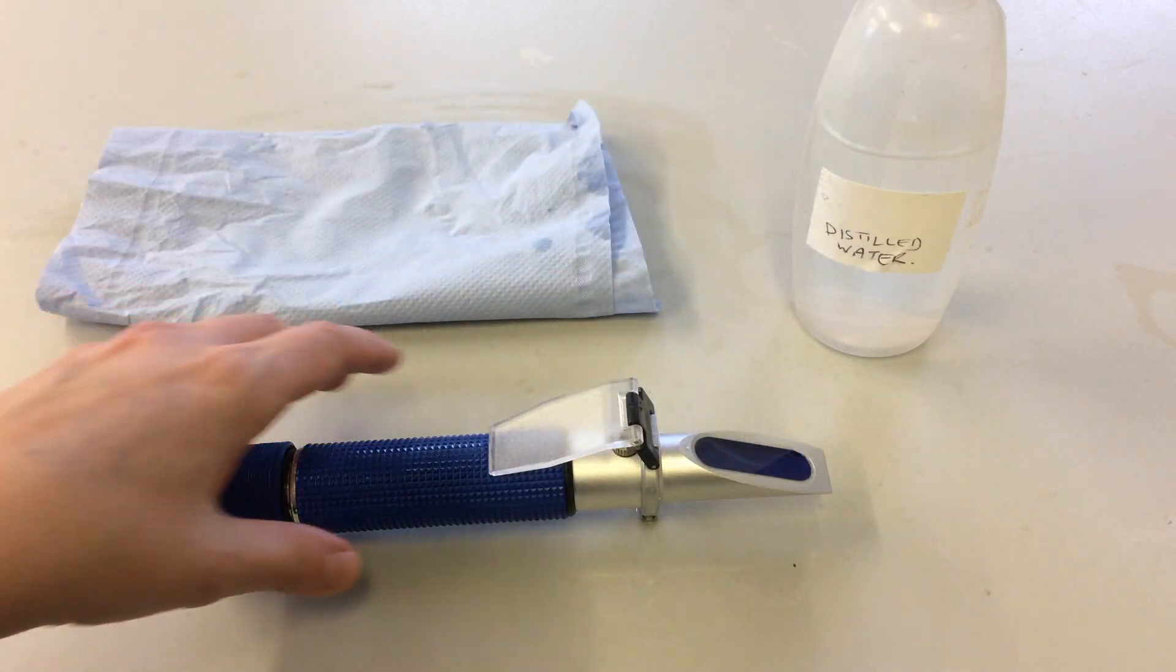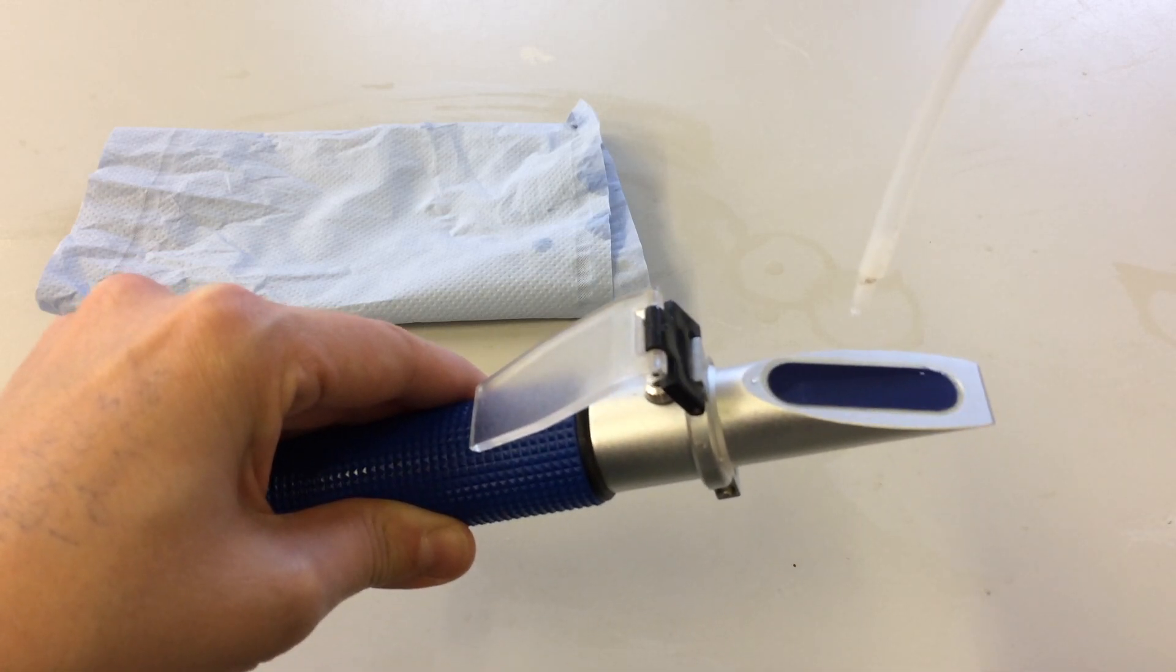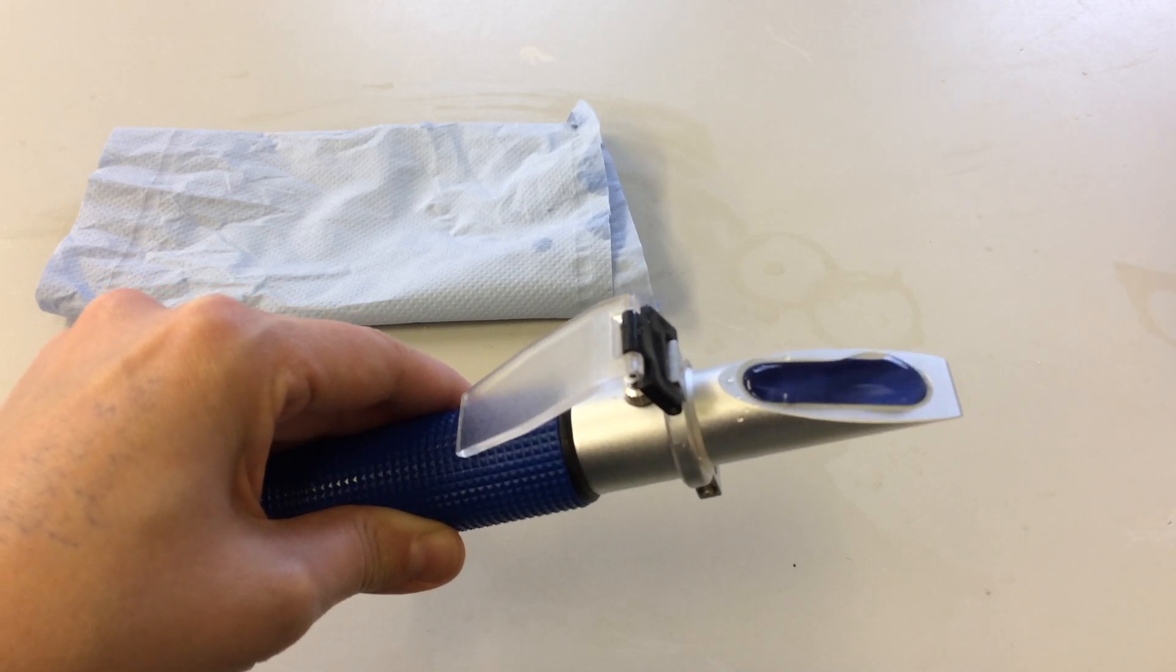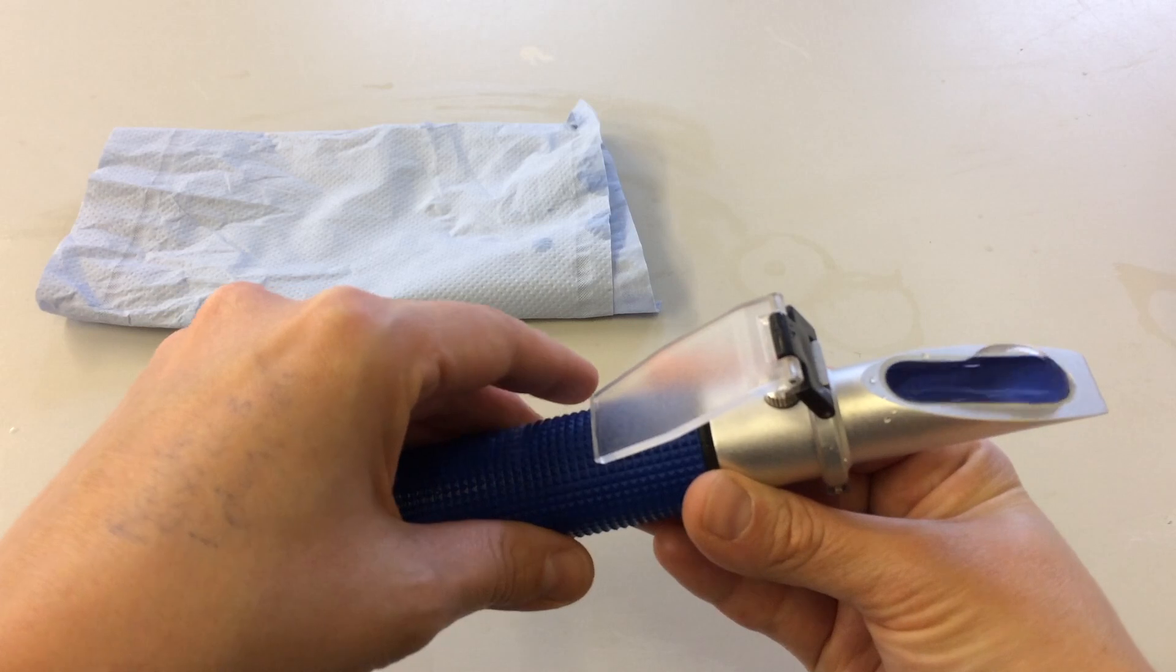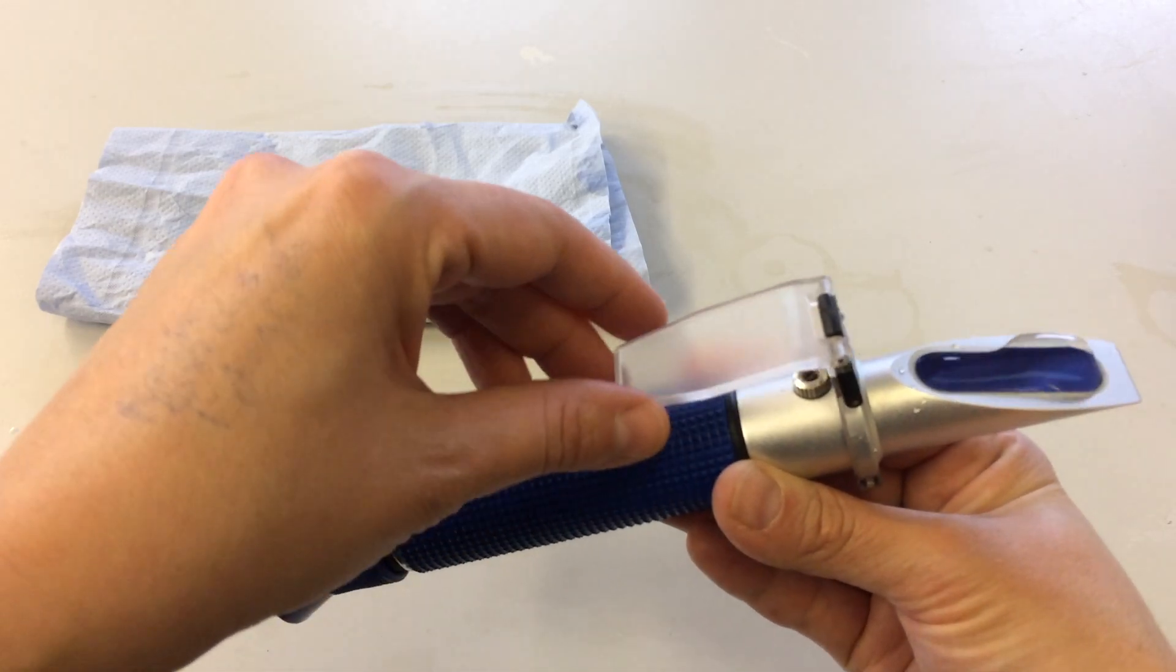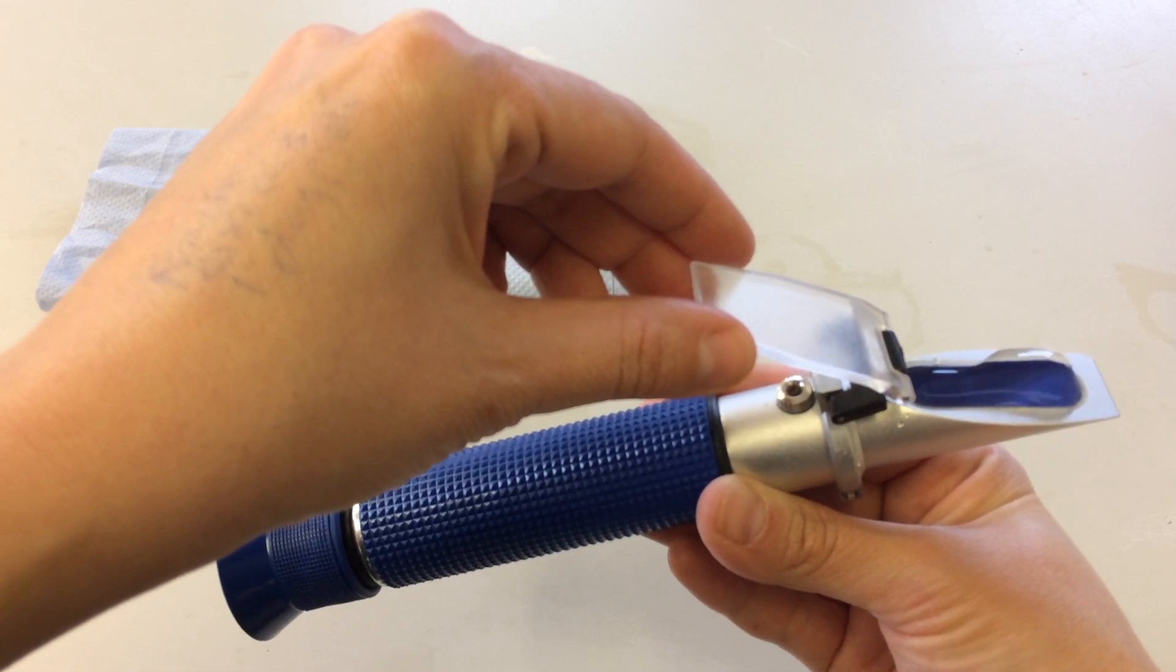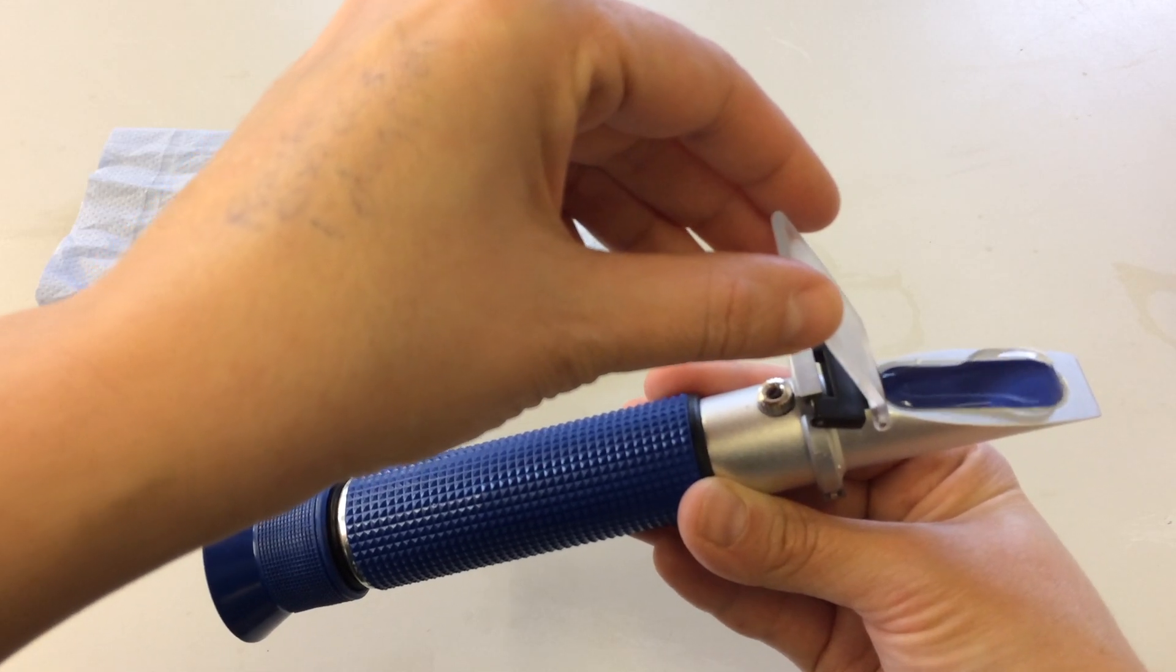Now it does take a bit of practice when you haven't done this before, but using the distilled water, you can just create a nice big film there. Then, using the cover plate, you need to squash your sample between the cover plate and the glass section that the water's on, but you need to do this without creating air bubbles. So it does take a bit of practice.